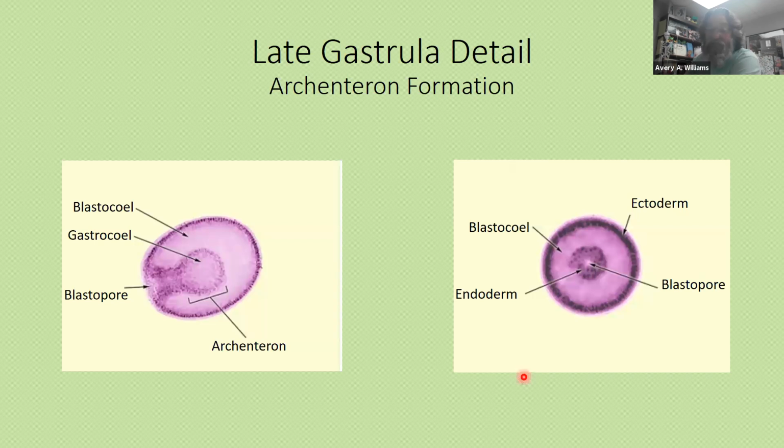In lab, I just simply want you to recognize that is a blastopore, and that's going to be the future anus of a starfish. And there's another view of it. This is the archenteron. Of course, this tissue right here would be endoderm. This tissue on the outside, that's ectoderm. In this view, you can't see the mesoderm, but the mesoderm would be out here. See how it's kind of poking out on the sides? That's the development of the mesoderm.